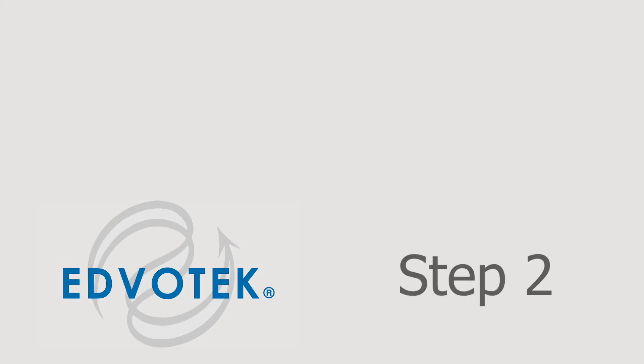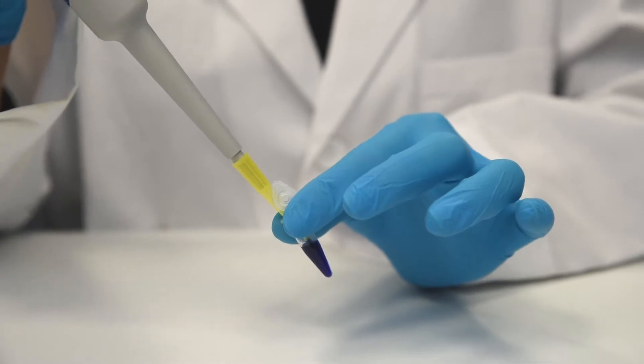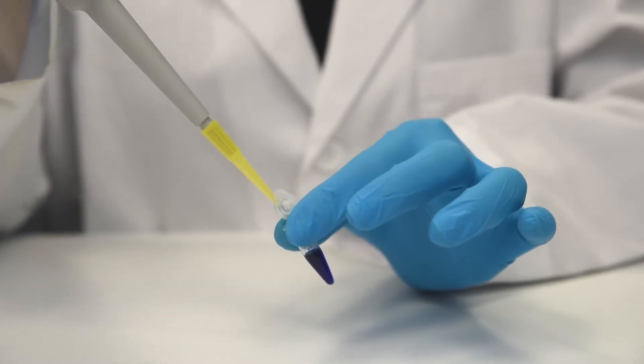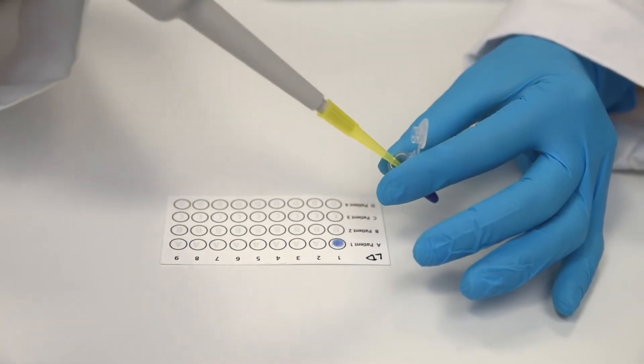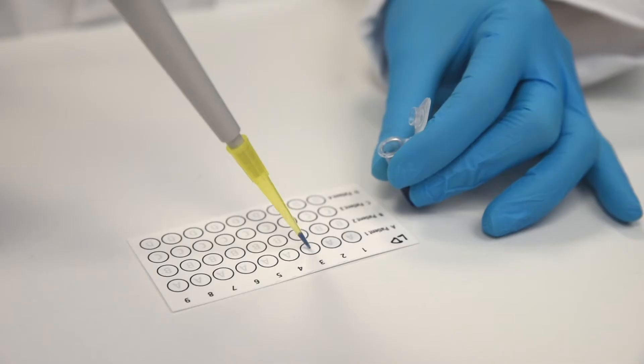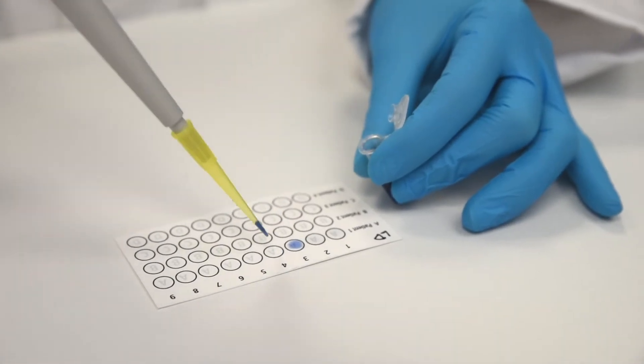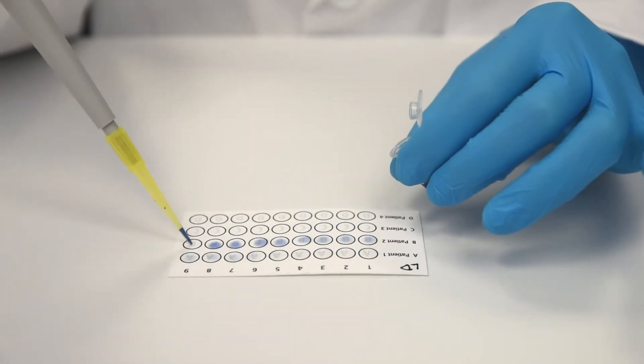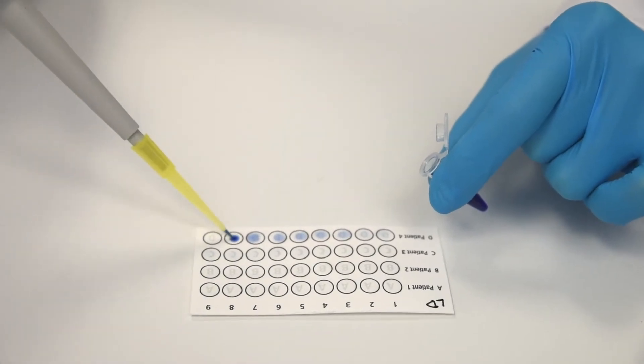Step 2. Using a micropipette, apply 5 microliters of equilibration buffer (EB) to each spot on the microarray card. The same micropipette tip can be used to add equilibration buffer to each spot on the entire card.